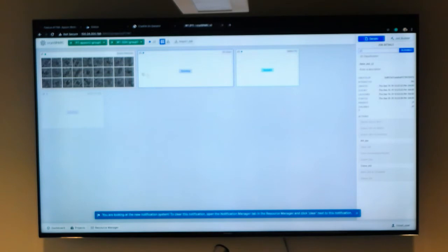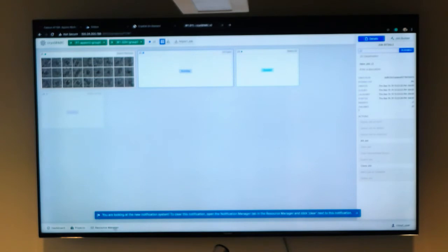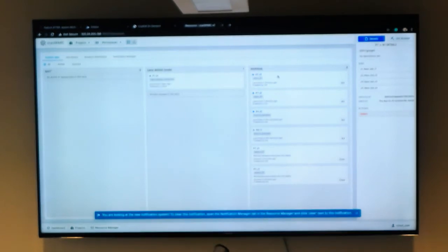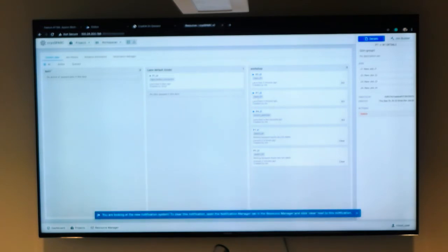Okay, so when working in your various instances or project folders, try not to queue up too many jobs. We can see we have at least 16 GPUs, and while we're not quite using all of them, the main thing is to make sure you make use of the workshop node, because that's what we're using for this particular instance. If you accidentally default to either of these two lanes, there are no resources, meaning there are no GPUs or CPUs that you can make use of. So that's the resource manager, so you can see what resources are being used.